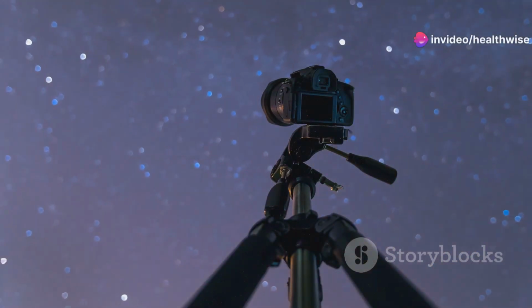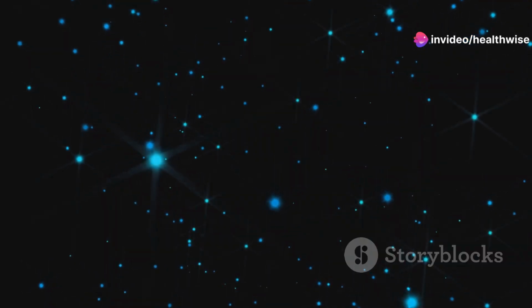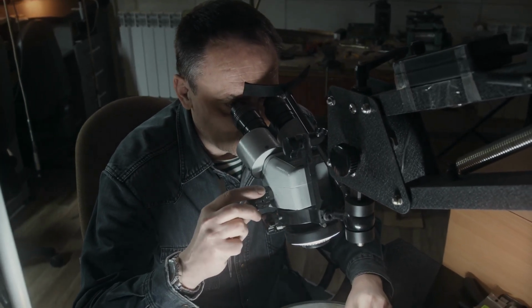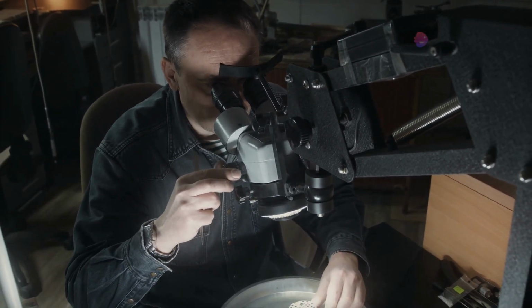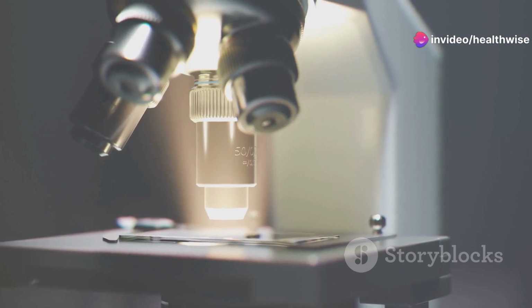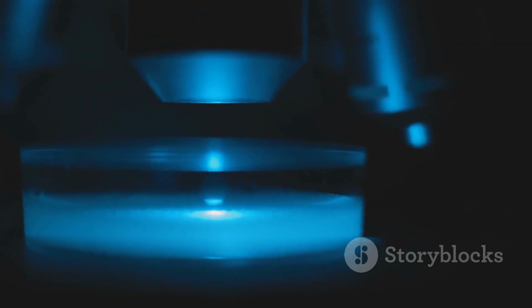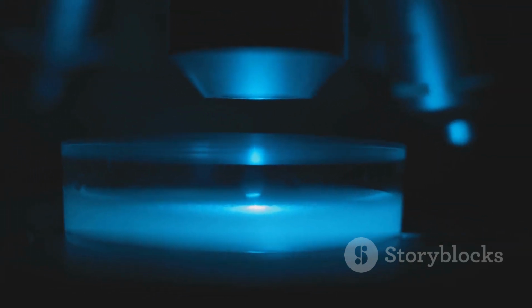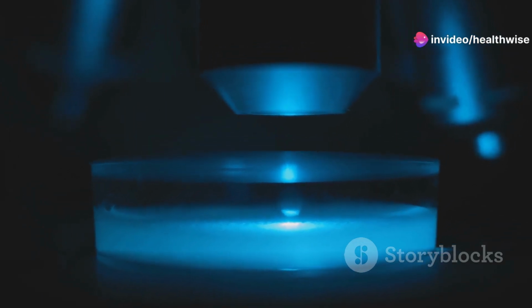Imagine a starry night sky. The darkness provides the perfect backdrop to see the faint glow of distant stars. This is the principle behind the dark ground microscope. Instead of illuminating the entire specimen like a traditional microscope, the dark ground microscope uses a special condenser. This condenser blocks direct light from reaching the objective lens. What we see is light scattered by the specimen itself. The result is striking. The specimen appears bright against a dark background, revealing incredible contrast and detail.